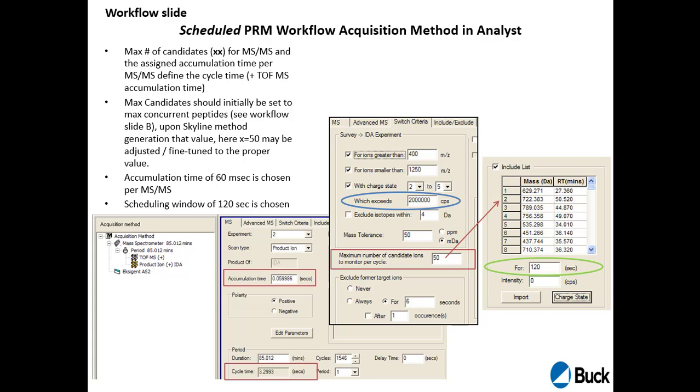But SciEx does it so that these inclusion lists in SciEx, usually you set them at a really low threshold and then it will trigger that. And if it cannot find the trigger, it will do something else. But here, you set the trigger super high, so it can never really trigger anything, and then it will just go through what is in the inclusion list.